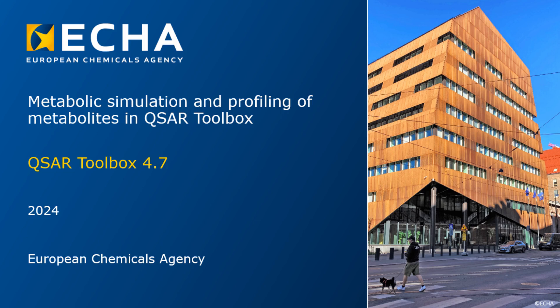Hello everyone. This video tutorial is about how to apply metabolic simulators and profile the obtained metabolites in the QSAR toolbox.